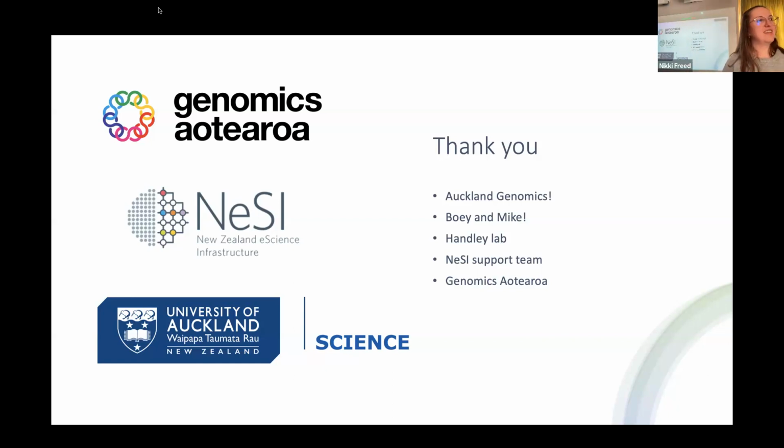There are two types of data that come off any flow cell: the standard FASTQ files, which have the base calls and quality scores, and then there are FAST5 files, which have all that rich information about methylation and the squiggle. The FAST5 files are very big. So sometimes people complain about the data amount because the FAST5 looks huge.